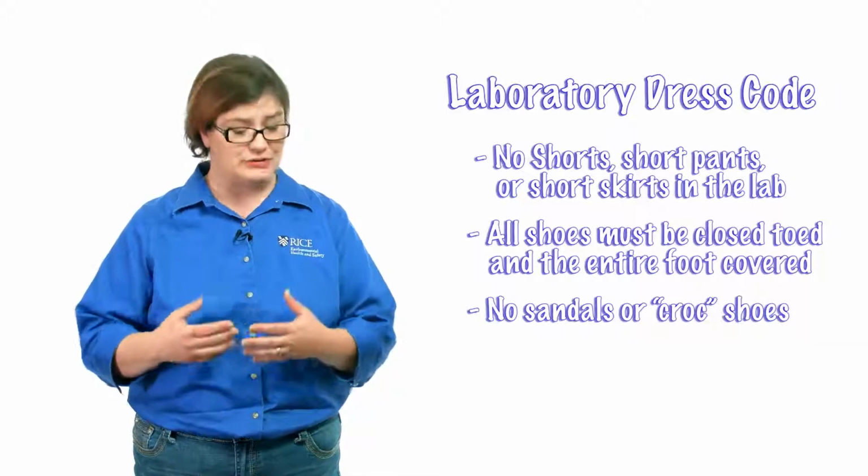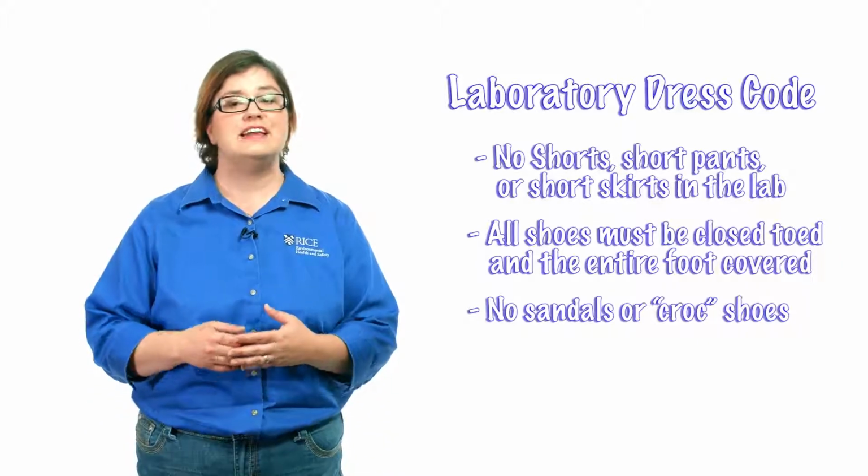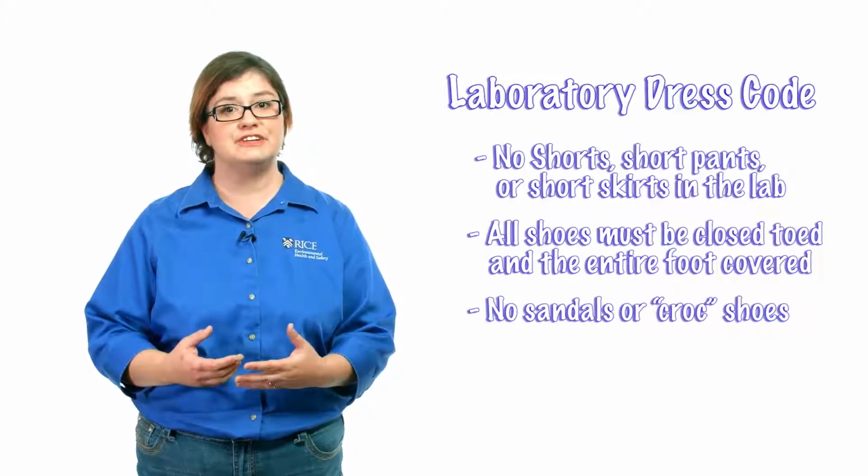I also want to talk about proper laboratory dress code. The dress code for any laboratory environment is going to include long pants or a long skirt and closed-toed shoes. It is best if the entire foot is covered.